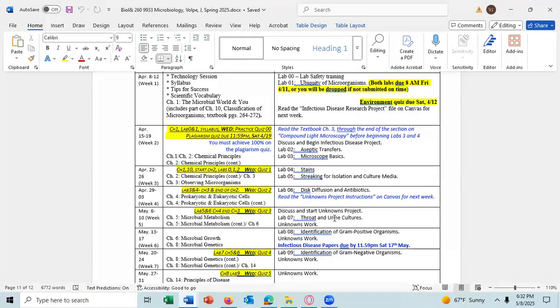All right, you've already started the glucose hydrolysis project. You started that on Tuesday. And on Tuesday, before I send you the results, you'll be starting the gram stain.